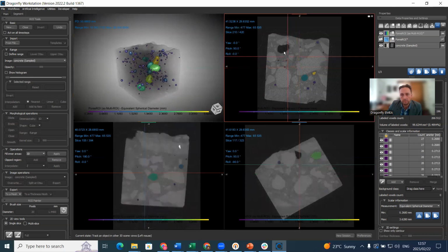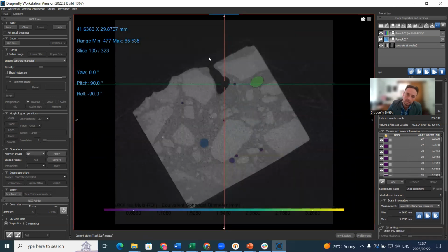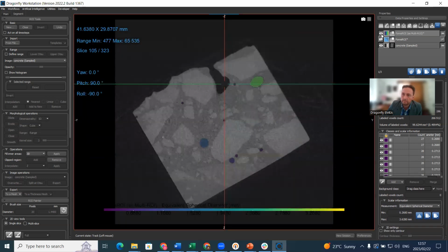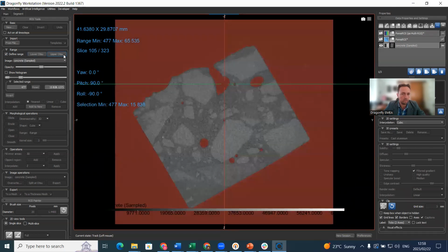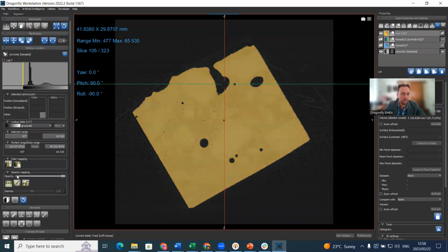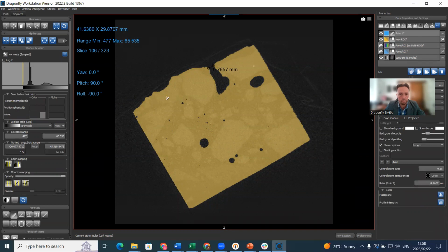What I wanted to show you is this pore here. And there you can see why it's not included in the analysis. It's an open pore connected to the surface. So I can spend a bit of time showing you how to include that in the analysis. Let's do that real briefly. There are different ways of doing it. The simplest way is to use upper Otsu to define the material, and then we can check what is the size of this cavity. It's approximately 0.7 millimeters opening.